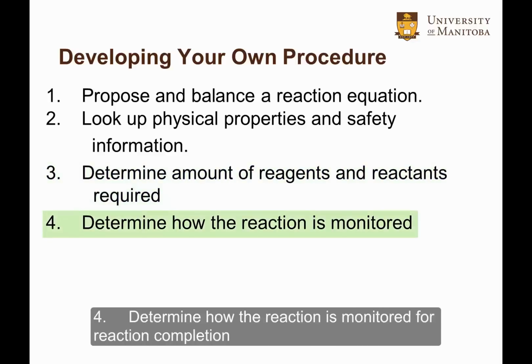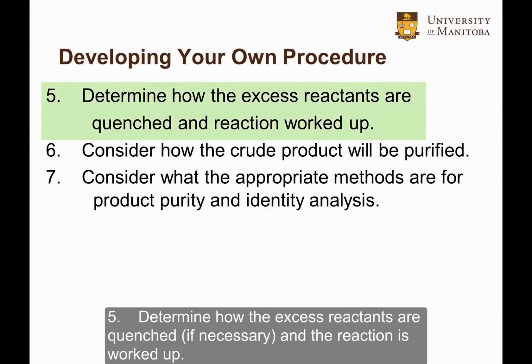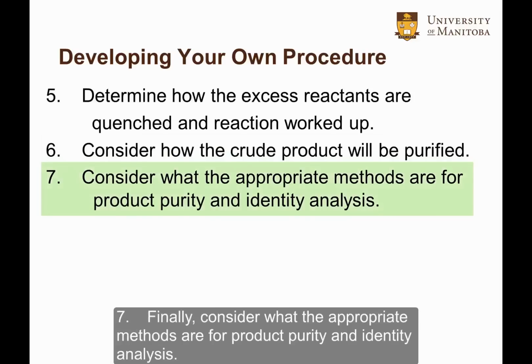4, determine how the reaction is monitored for reaction completion. 5, determine how the excess reactants are quenched, if necessary, and the reaction is worked up. 6, consider how the crude product will be purified. And finally, 7, consider what the appropriate methods are for product purity and identity analysis.